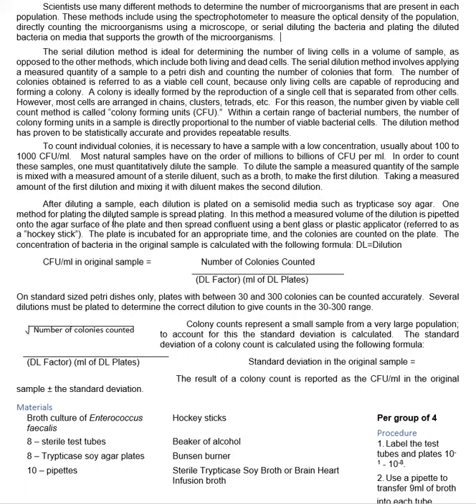Now obviously we're going to sterilize the mouths of the test tubes when we open them, the same way, flaming the mouth when we first open them and before we set them aside. We're going to shake it up and stir it to make sure we get a good even spread, because otherwise we won't get a good sample.